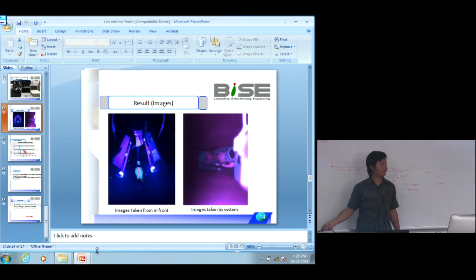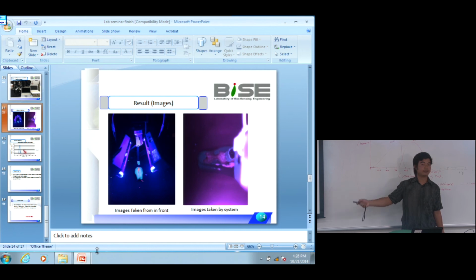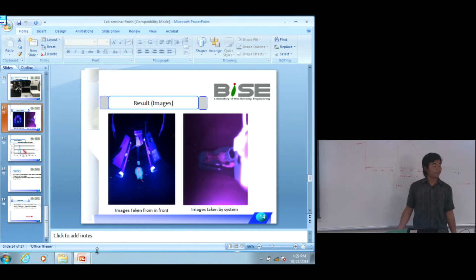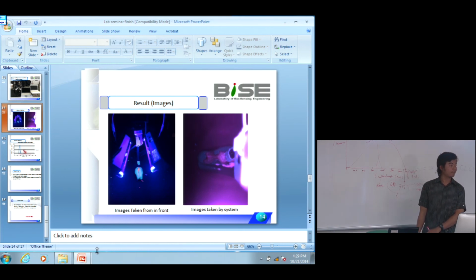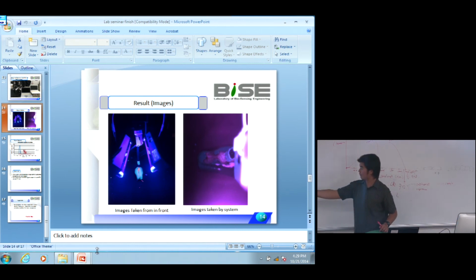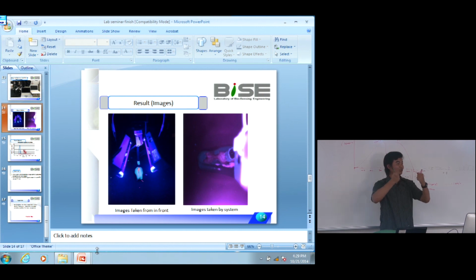What is the right part? This is fluorescent phenomena from the Pima, from the image. Is that the right part one? So maybe this is halation. No, more right part. Maybe fluorescence light or something. This part is plastic I use to hold the holder.